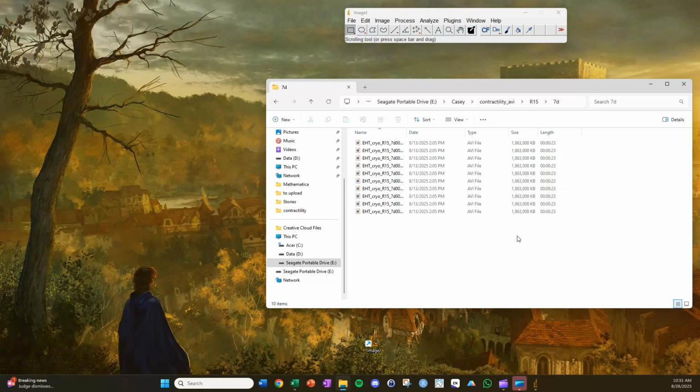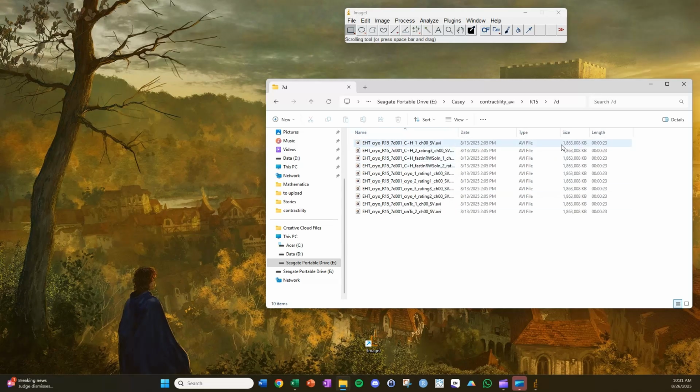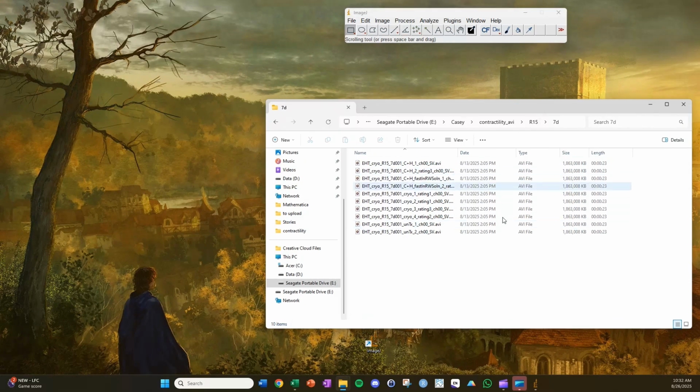I think I might have had another comment pertaining to that. Oh yeah, so I think what you'll read in the paper on MYOCYTER is that you'll want to be taking it more than 10 frames per second. We didn't have the capability to do that here, and it would be even more space intensive if you were to do that, but the data would be more precise if you did have a higher frames per second. So that would be something to consider when taking the initial videos.